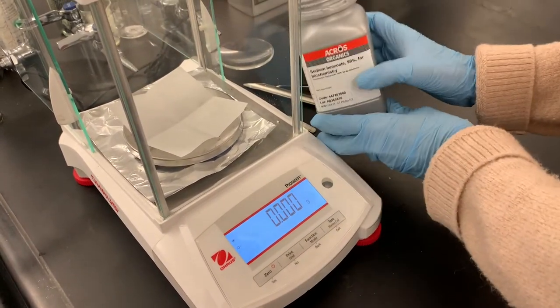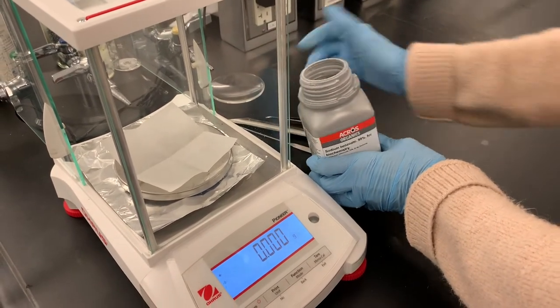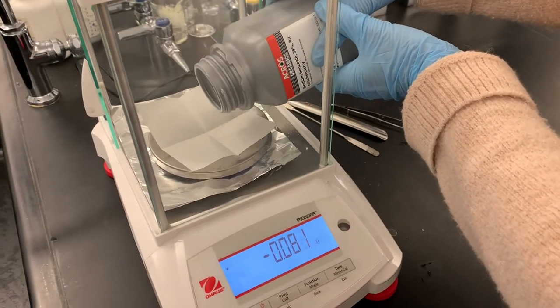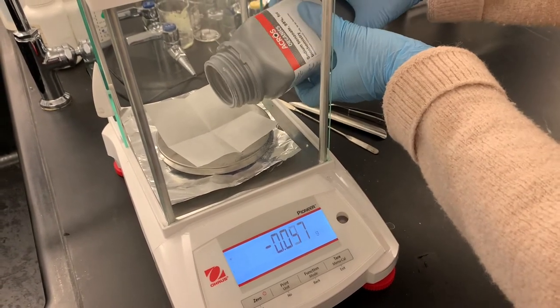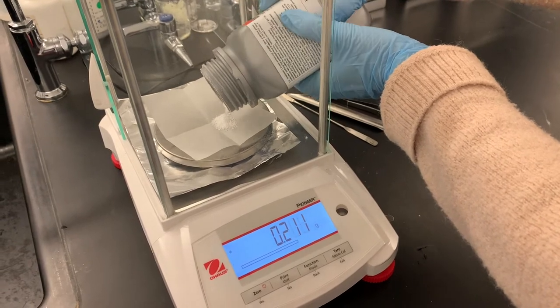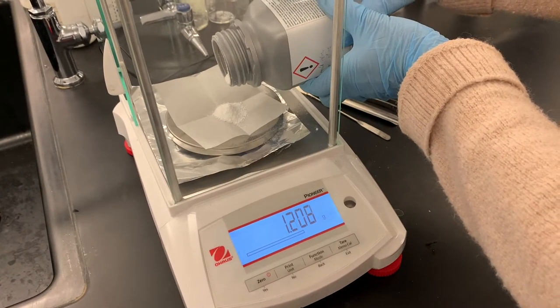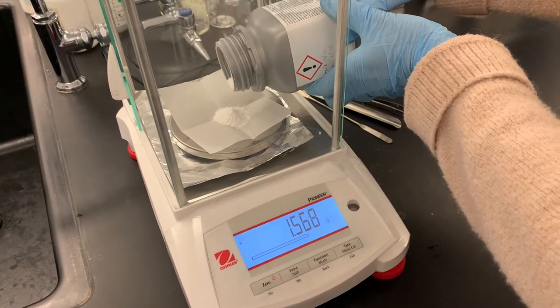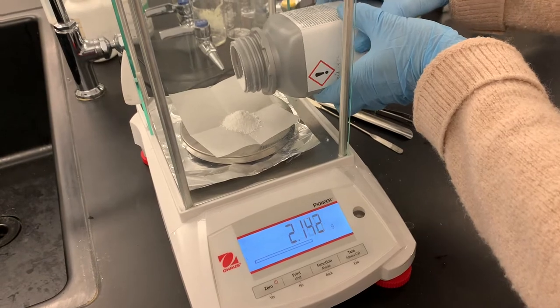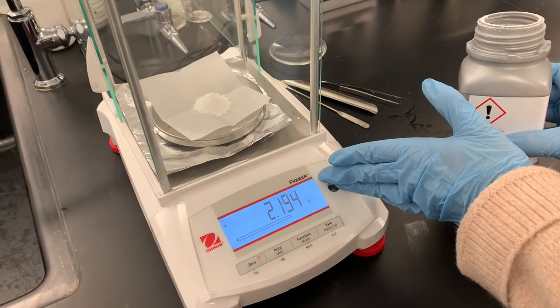When you are weighing, especially directly from the bottle, it's a really good idea not to jam spatulas into the bottle — that introduces contamination. The safest way is to just carefully tap out what you need from the bottle. I'm keeping an eye on the display to make sure I'm not getting too much. Rotating the bottle gives a little more control. I'm going to step back and let the balance stabilize — there's our mass: 2.194 grams.